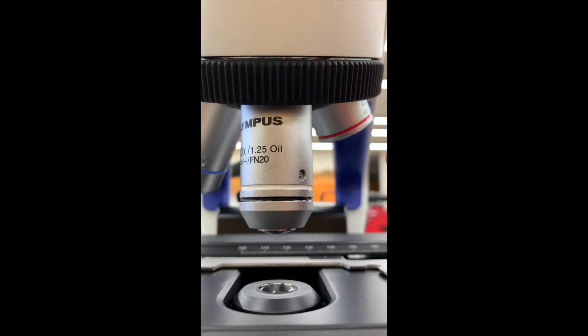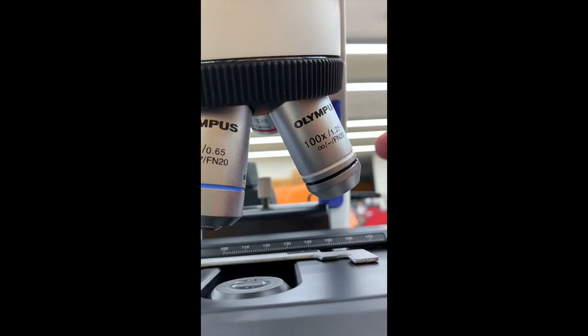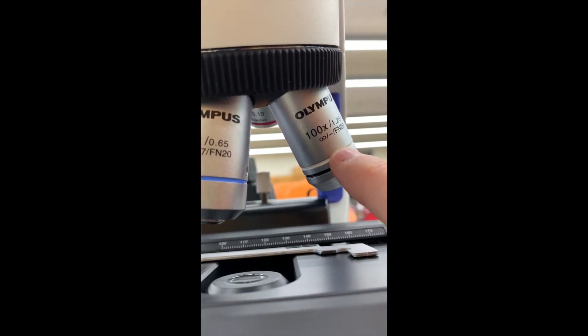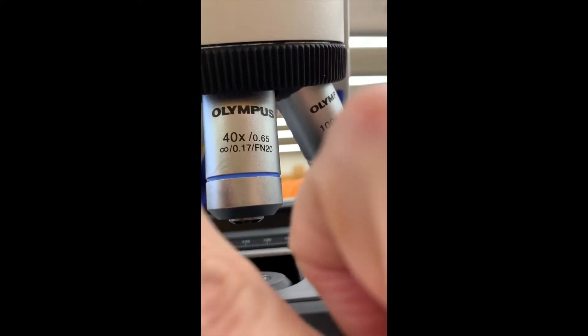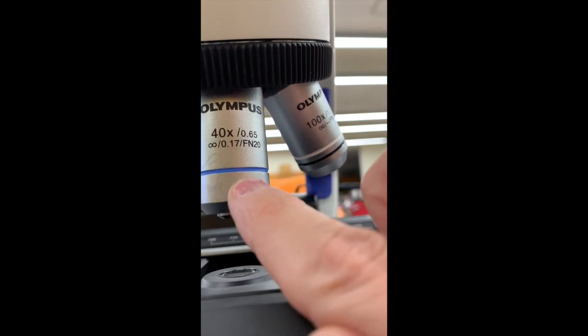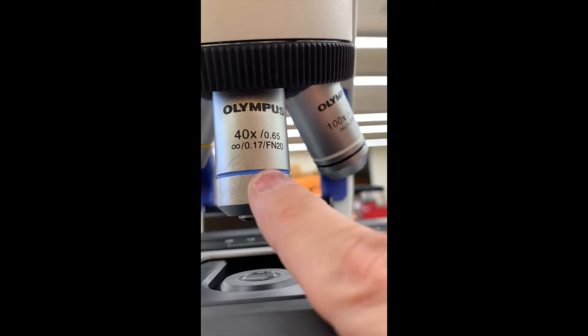When you're done with your slide, you will clean both the 100x oil with the lens cleaner and lens paper, and the 40x as well. They're both long and if you accidentally twist this through the oil, you'll get oil on it and it will ruin the lens. So we clean both.